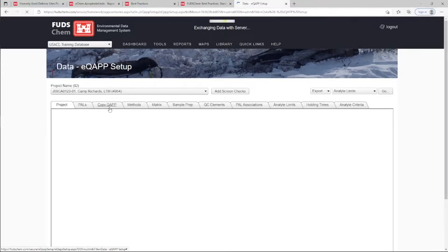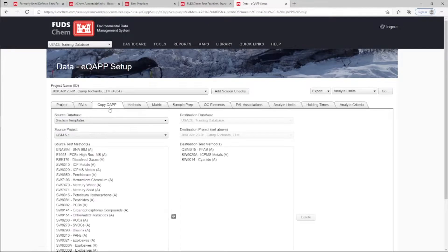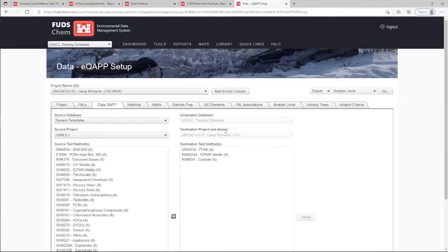FUDSCHEM's EQUAP Setup tool includes the method group, matrices, and standardized units for each method template by default.